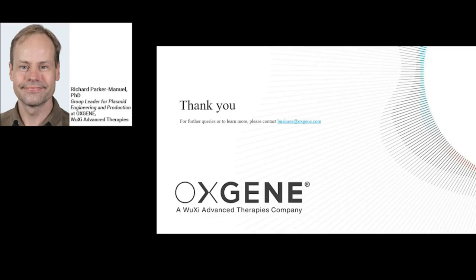So the last question for this webcast is, does RepCap optimization improve performance for all serotypes tested, and would it also benefit custom plasmids? So all of the serotypes that we've tested so far have been improved by using our modified RepCap configuration. And so I would predict that it would also benefit custom capsid genes as well.